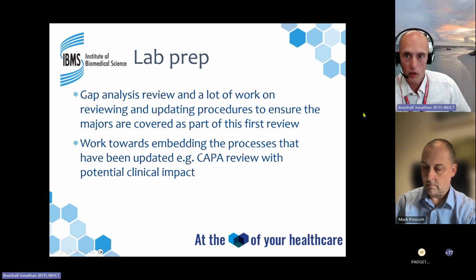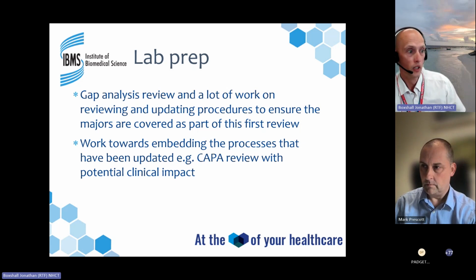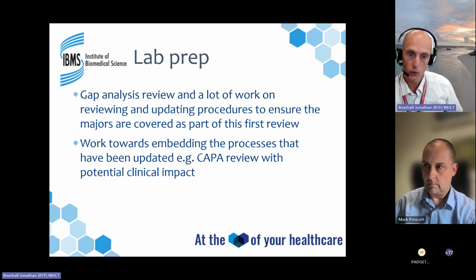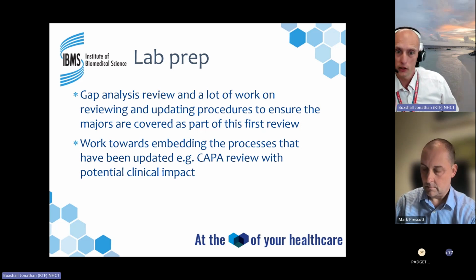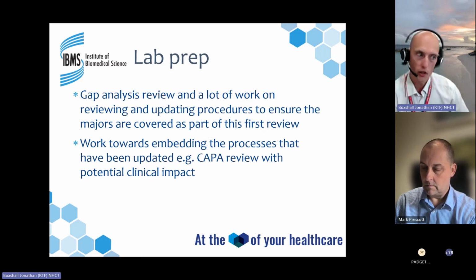And then what we did is work towards getting these processes embedded within our quality management system. So for example, we updated our CAPA template so that we had potential clinical impact, which was a new thing. So that was rolled out and pushed, and we did some education meetings to explain why this was required, and the harder bit, which was informing our clinical teams that they're going to have to get more involved in some of this quality management system stuff.